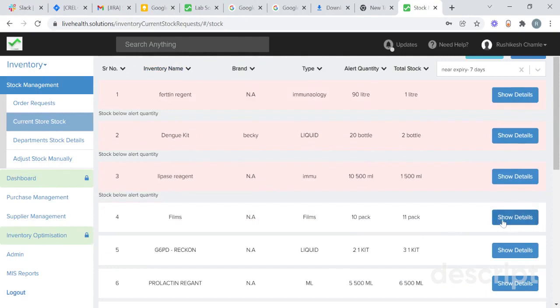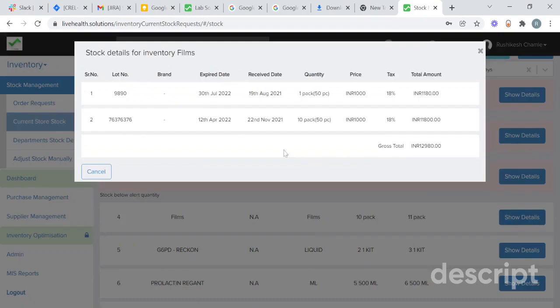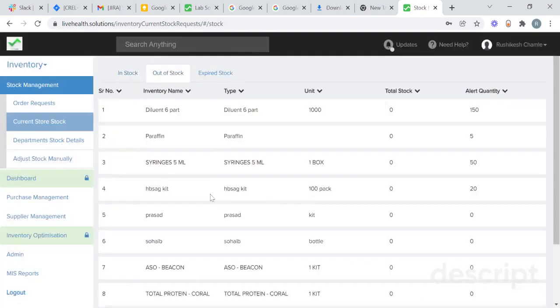When you click on show details, you will get details of that particular stock with lot number, expiry date, receive date, quantity, their price, and total amount. You will also get details of the stocks which have been out of stock.